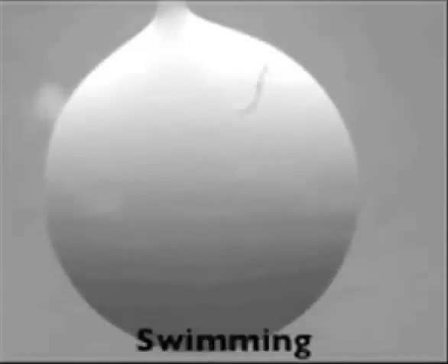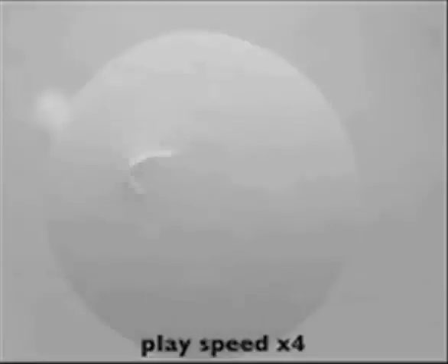Now the interesting thing here is that our lab has recently discovered that the worm's forms of motion, crawling on land and swimming in water, are distinct. Kind of like how people have distinct forms of walking and running gaits. And eventually the water soaks into the agar like a sponge. And after that happens, this normal worm has no problem switching to crawl and crawls merrily on its way.